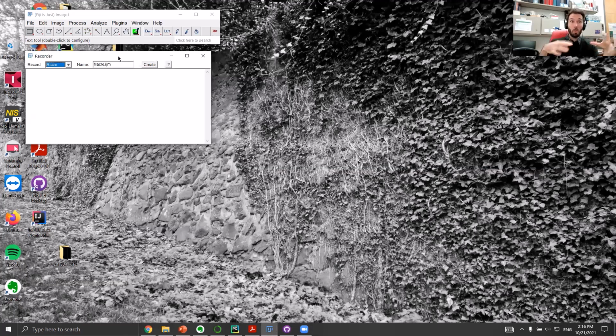This is going to record all the things that we do and put out the actual command that we're going to use in our macro. For most of what we're doing today, we're not going to be going crazy coding and writing commands from scratch. We'll really be just copy pasting commands from our recorder, and then applying little modifications as necessary to get our scripts to work.